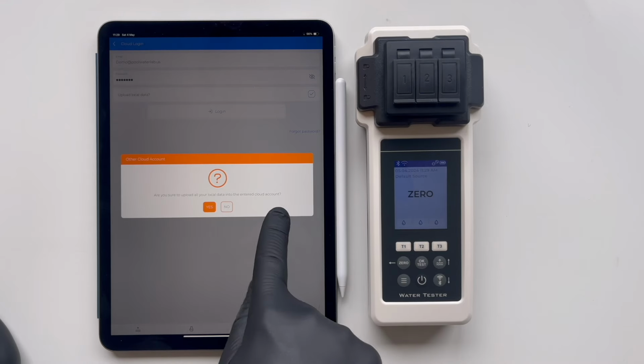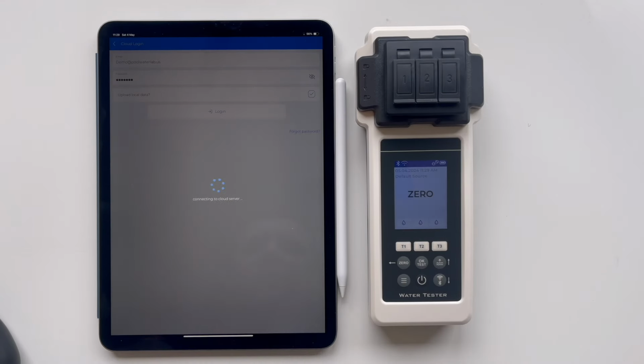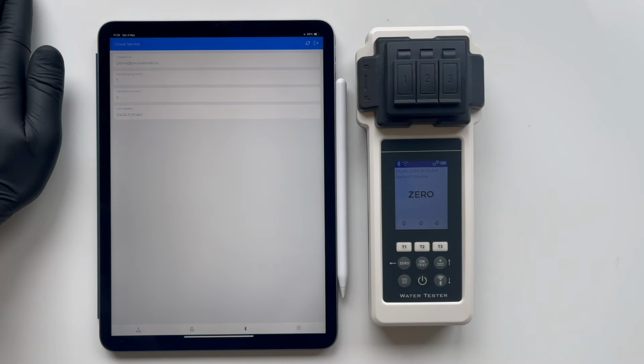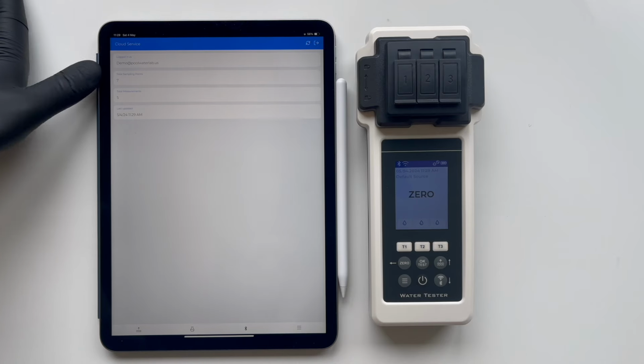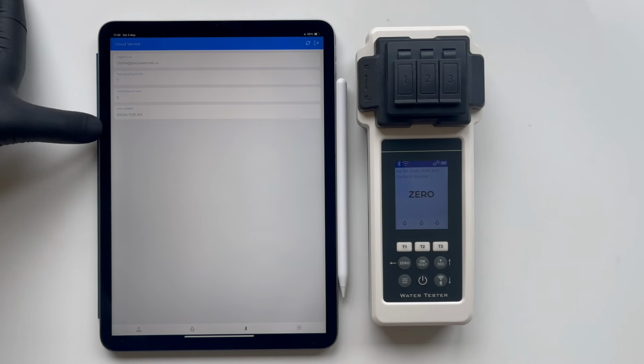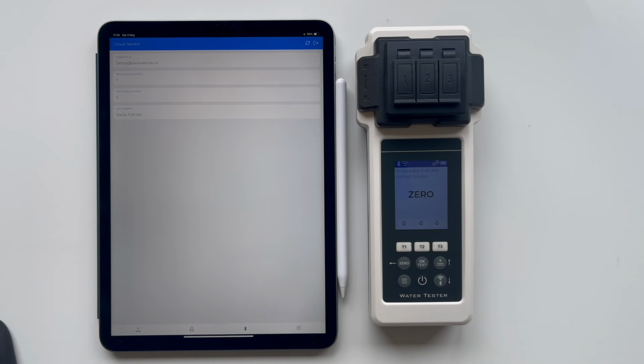The tester will ask, "Are you sure to upload all your local data?" Confirm this. On the screen, you will see your account and its contents. Next, you need to create a sampling point. The icon for creating a sampling point is located at the bottom left.